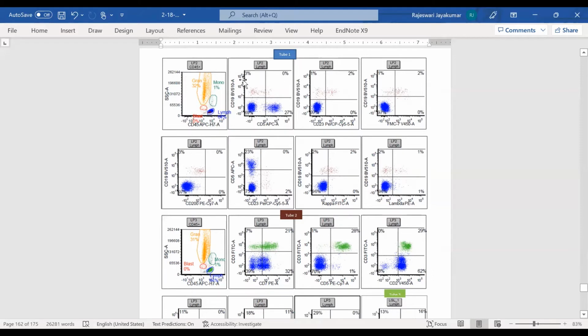And the lymphocyte gate is composed of both T cells and B cells. The B cells are CD19 positive. If we track them, they have a small spray of CD5 like you usually see in the peripheral blood. They have partial CD23 expression, FMC7 positive, negative for CD200, all normal, and they have a nice polyclonal kappa lambda ratio. So our B cells look fine.